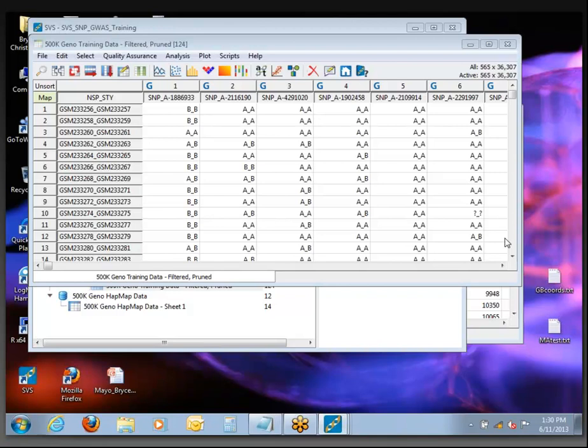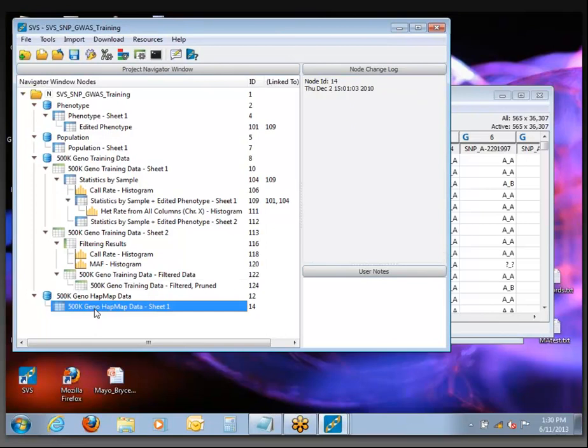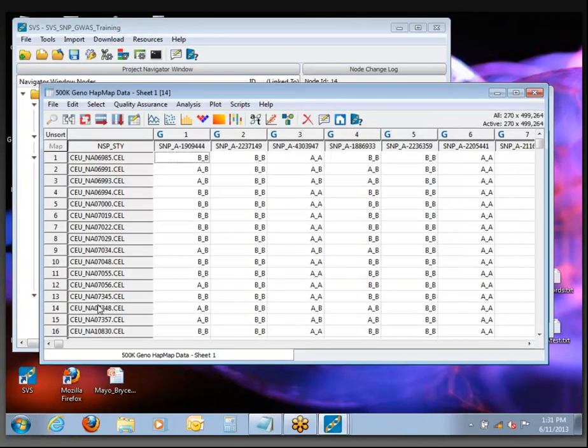Let's turn the page and look at Part 5: Sample QA, Population Stratification. You should have down at the bottom a node called '500k genotype data half map' — or '500k half map genotype data'. This is from HapMap Phase 2 populations where we have 270 samples from European, Asian, and African cohorts, and this genotyping was done on the same Affymetrix 500k platform. What we want to do is merge these together into one big data set to run principal components analysis, focusing on the same 36,000 SNPs we've already got.